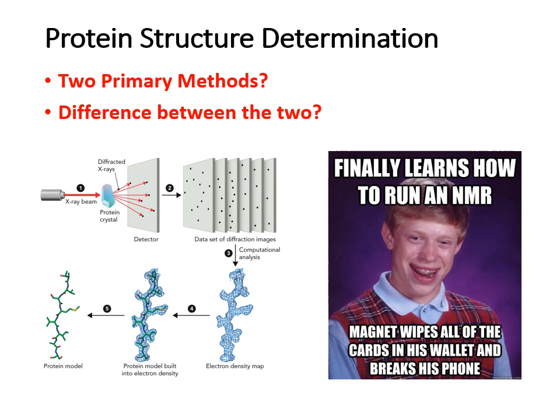Now, in addition to all of the stuff we've been talking about so far, like sequencing and whatnot, you have to remember that proteins are not just the sequence of their amino acids. A big aspect of proteins is how their structure is ultimately arranged, and things like folding. That's what we always say in biology and biochem and chemistry: structure defines function. Now, two very powerful, valuable ways to look at protein structure are X-ray crystallography and what we call NMR.